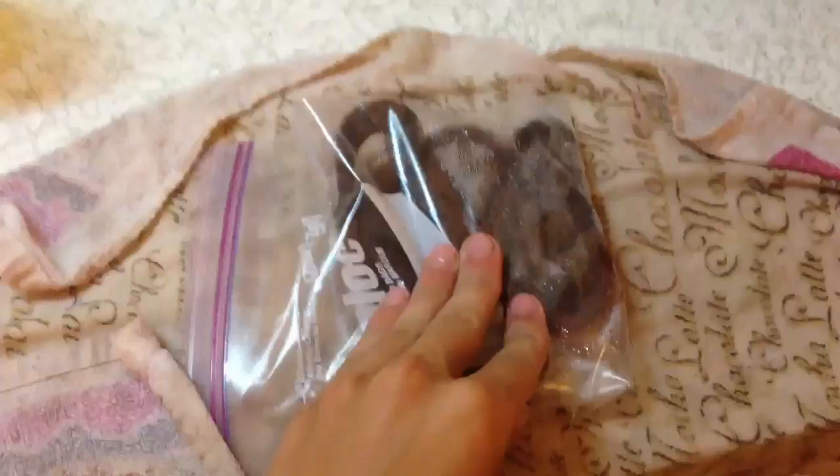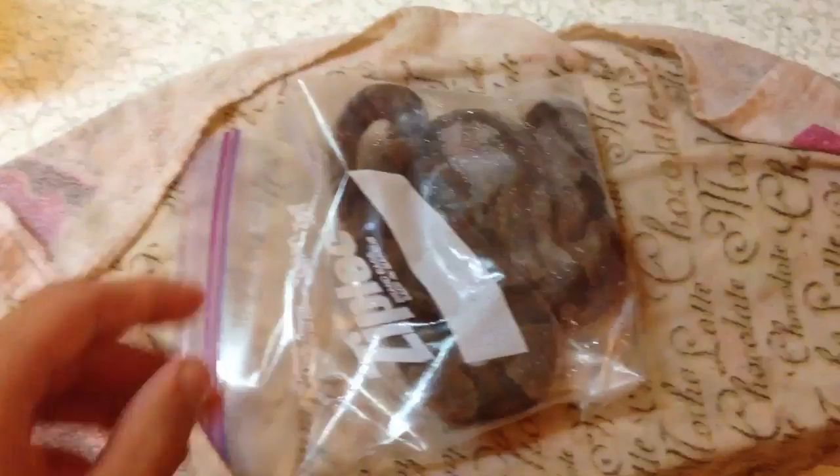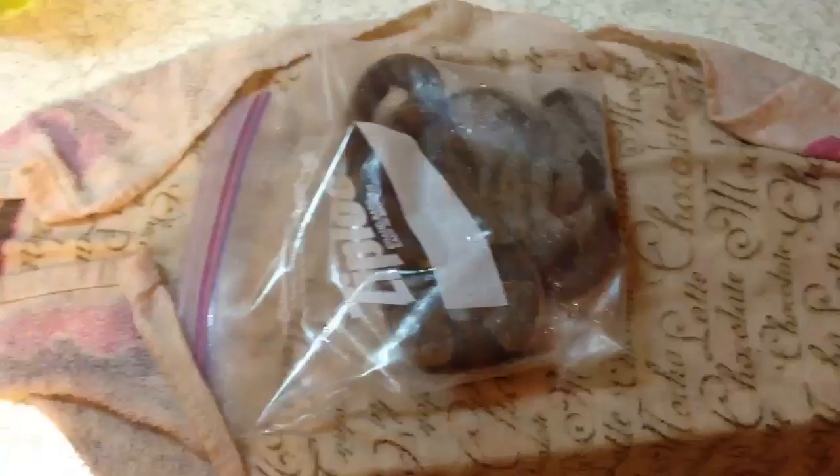Dude, what is up? I'm sorry for the shaky camera work. Today I'm going to show you how to preserve a dead animal, mostly a snake, turtle, or any other reptile, possibly amphibians also. It really works with anything as long as it'll fit in a jar.